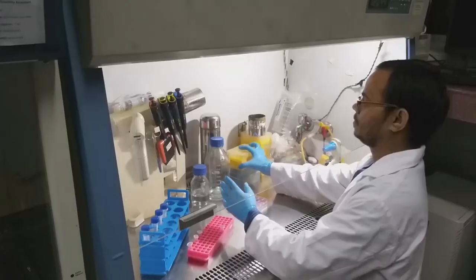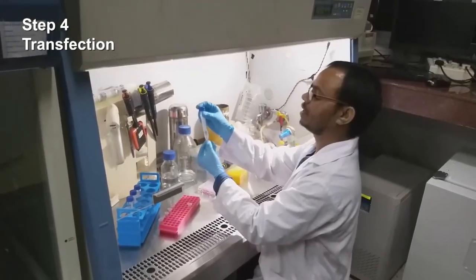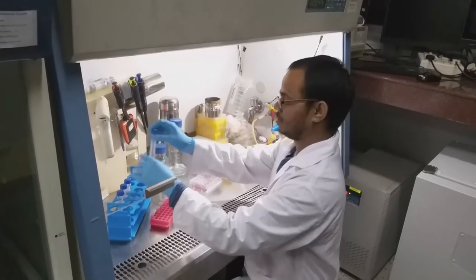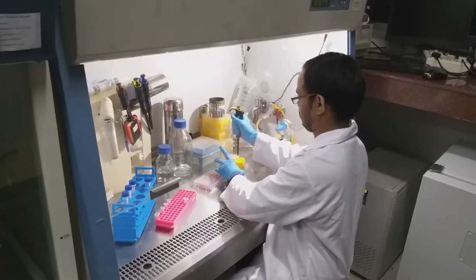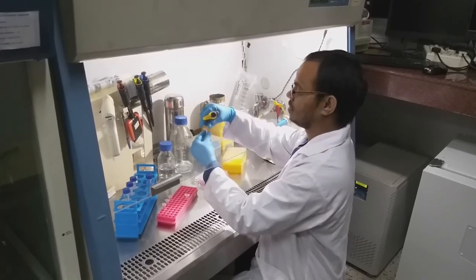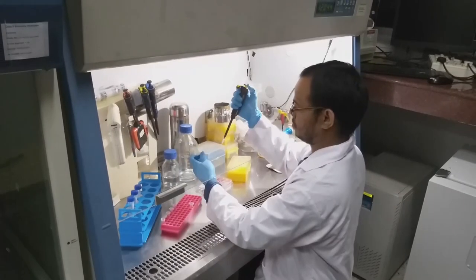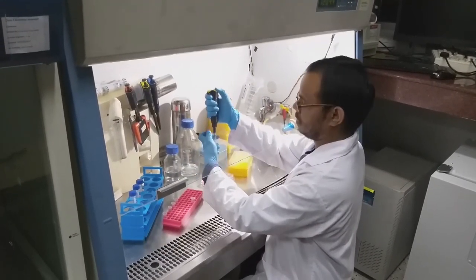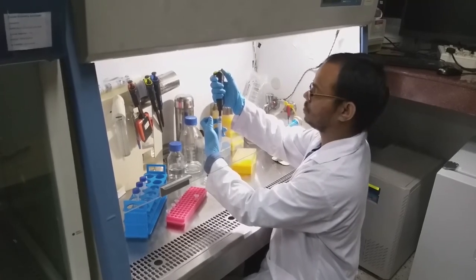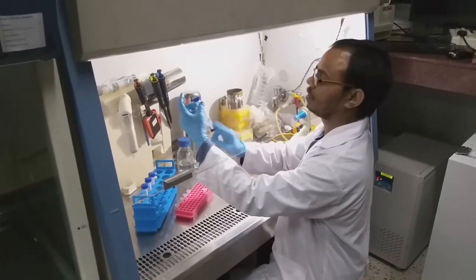Let's start. We have already aliquoted incomplete medium. So for this, we have to add plasmid DNA. This is the DNA, concentration already estimated. The mixing should be proper, otherwise there is no complex formation. You can tap the tube in order to get it mixed.